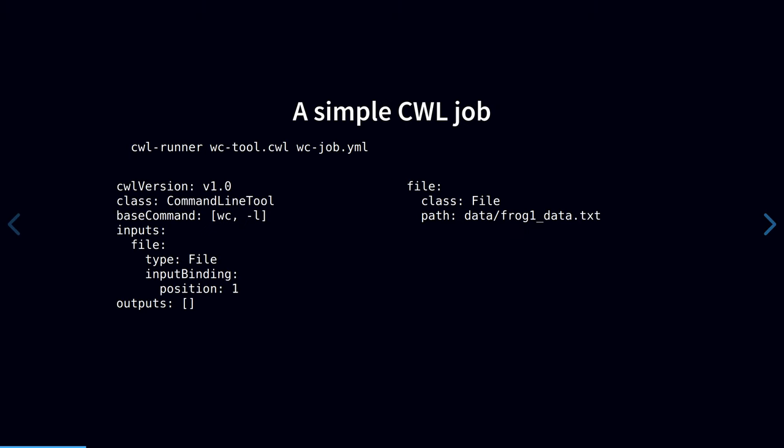For a single sample, using CWL is straightforward. You have a tool or a workflow file in CWL format, and then you've got a job file with sample metadata in YAML format. And you pass the tool along the command line to CWL runner and the workflow engine runs your workflow.